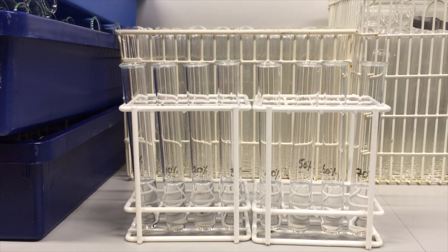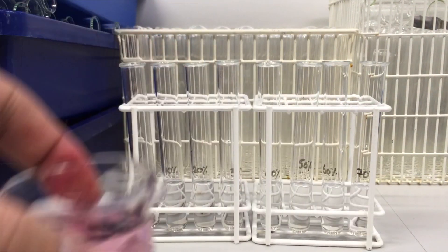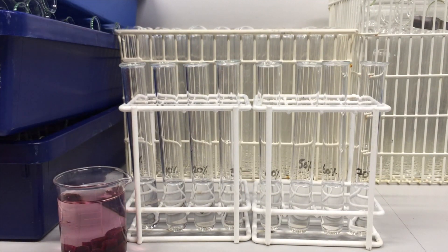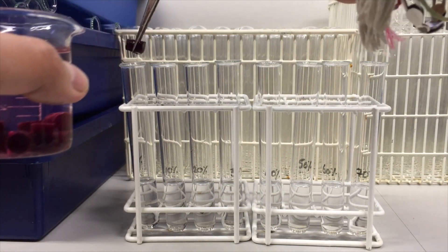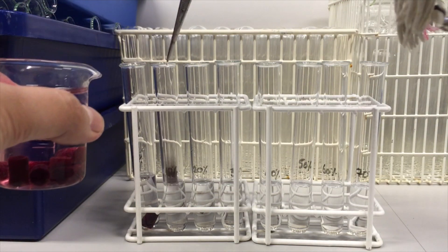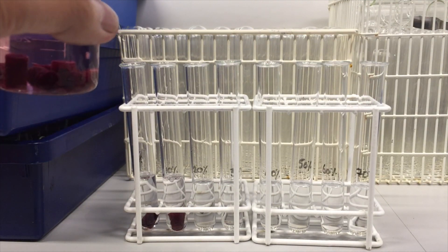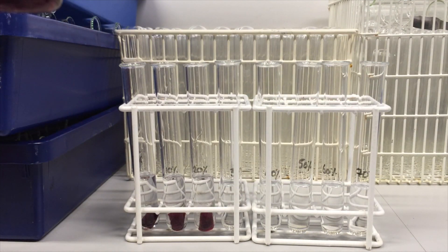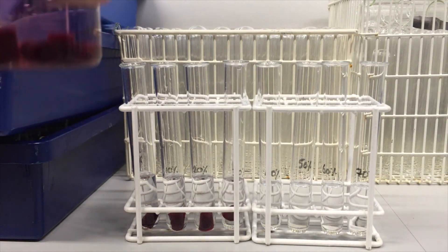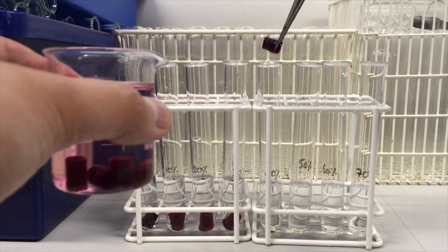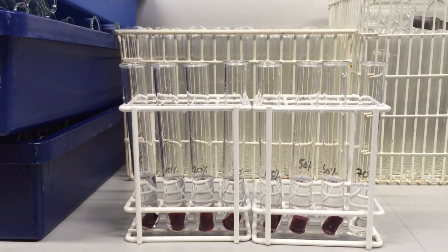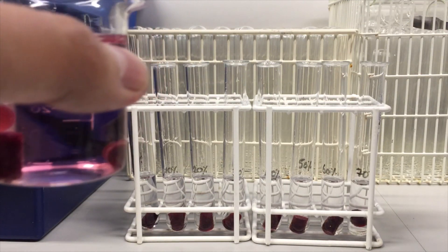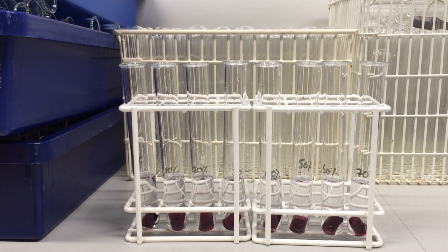So what I'm going to do now is to add my beetroot pieces into the different solutions of alcohol of varying strengths. Remember, we've just given it a quick rinse in water, so that there's no dye on the surface of the cells because we are making the assumption that any dye that comes into the water is due to the rupturing of cell membranes. So we need to get rid of that excess dye in the first place. And that's that, and we'll start a stop clock.